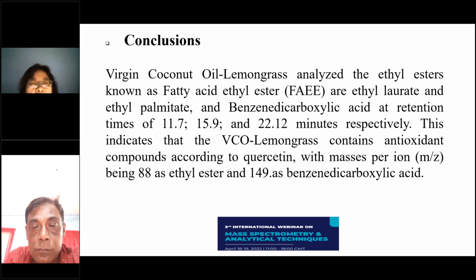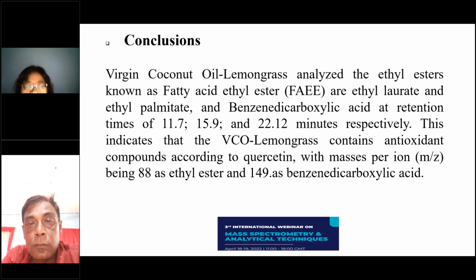And the conclusion: virgin coconut oil, lemongrass, analyzed the ethyl esters known as fatty acid ethyl esters, ethyl laurate, ethyl palmitate, and benzene dicarboxylate acid, at retention times of 11, 15, and 22 minutes respectively. We can see here the resolution by GC is good.